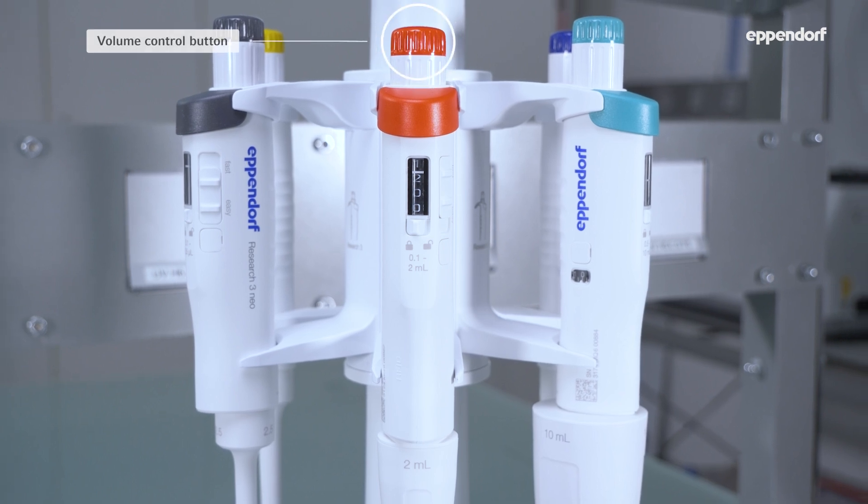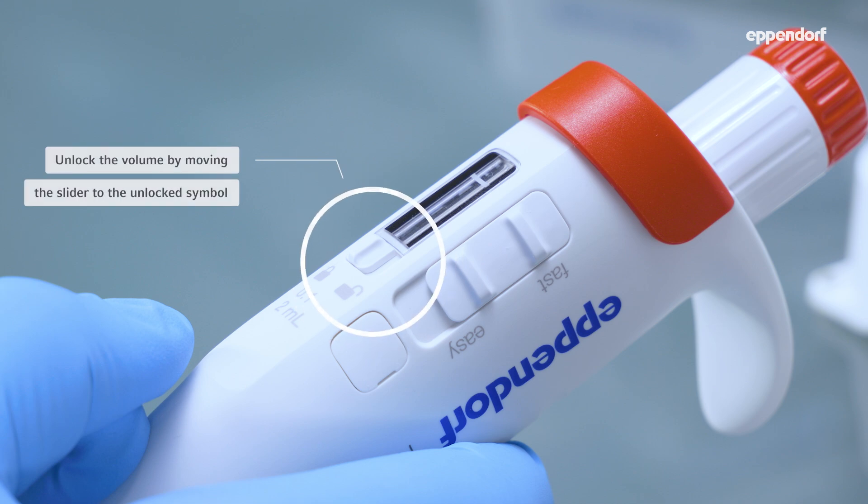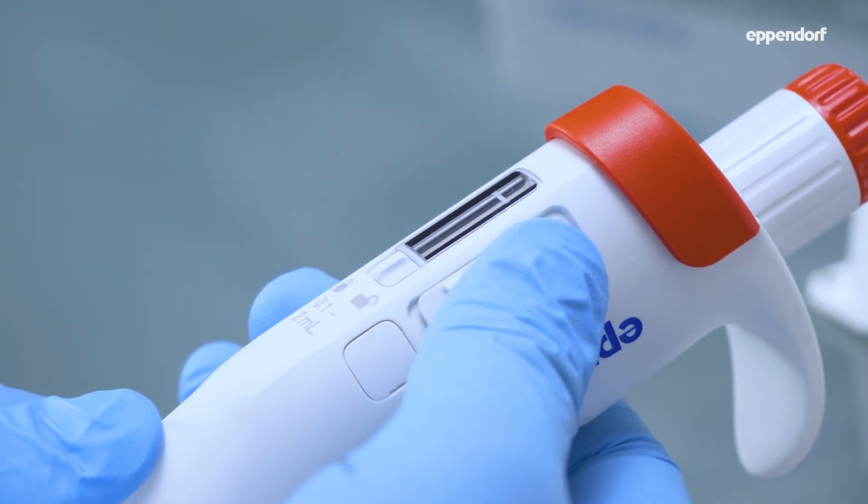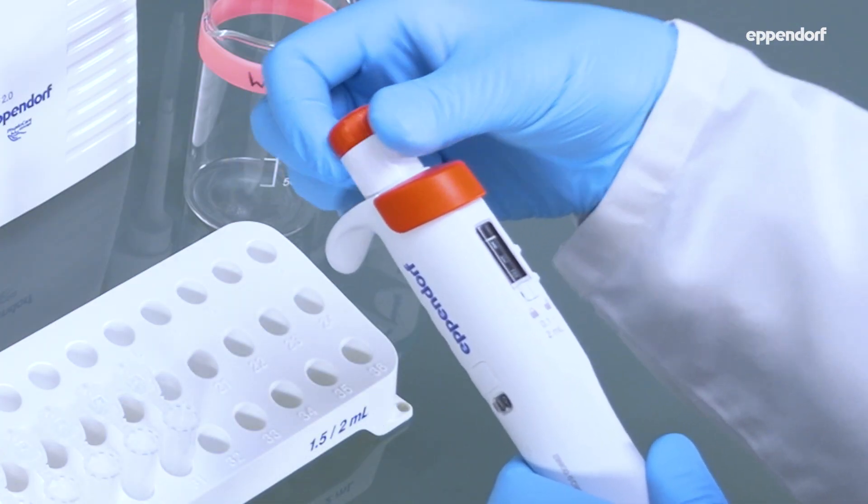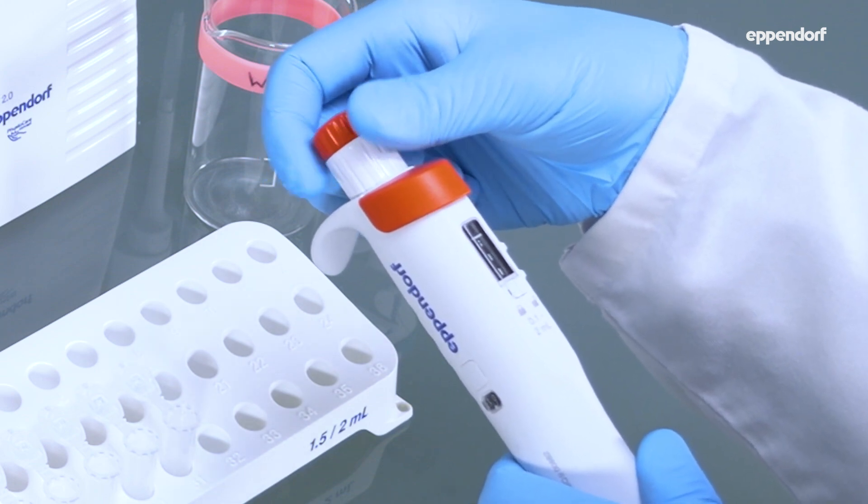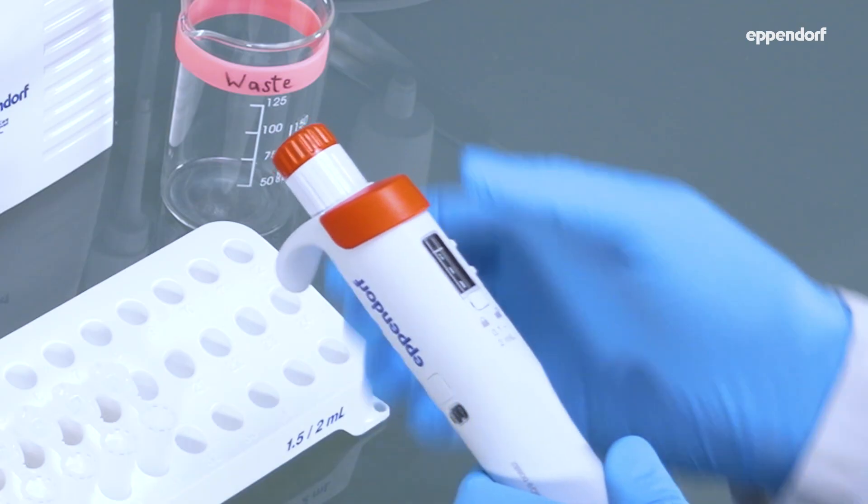Set the exact volume you want to pipette by turning the volume control button. In RESEARCH 3 pipettes, the innovative volume gear shift slider allows you to either fine-tune the volume with low resistance, or speed up volume changes with fewer rotations but a bit more effort.